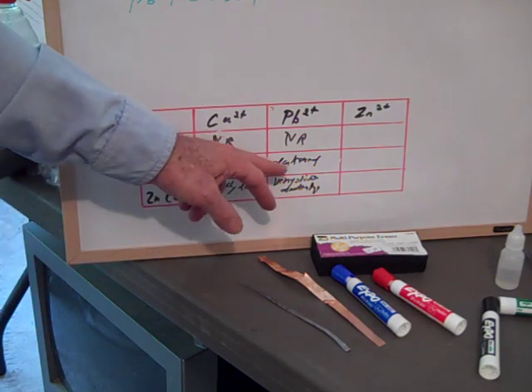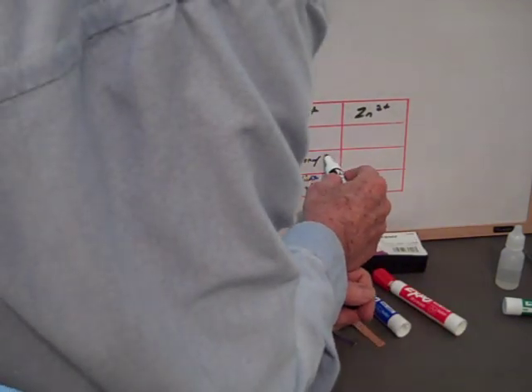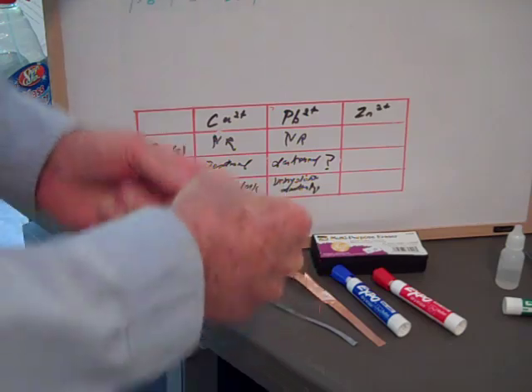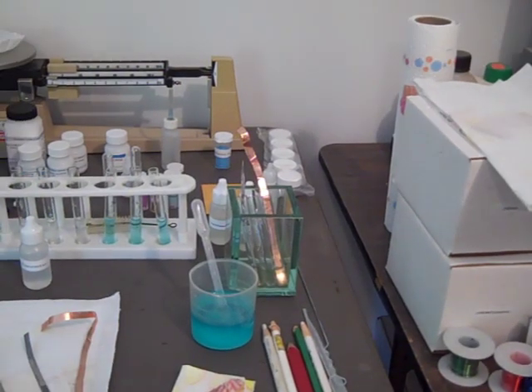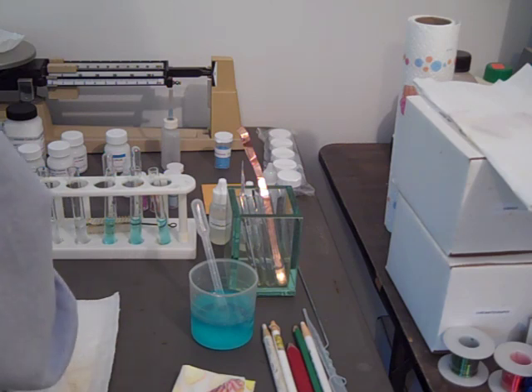I don't know why that happened. There's supposed to be no reaction here. So put a question mark next to it. Remember that. Wonder why that happened. You always write down your exact observations. I want to look at the other one. Move these away.